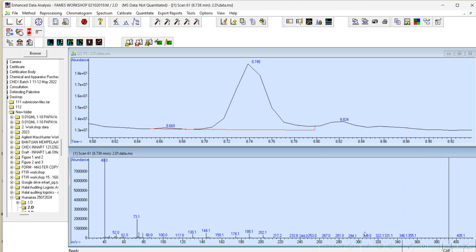So usually if you see, for example, 188.1 and 174.1, you can deduce or sometimes predict from 188.1 mass per Z, and then we have 174.1 mass per Z. So what are the potential chemical element that is being removed from this 188.1? Okay, but for today we are not going to discuss this one.